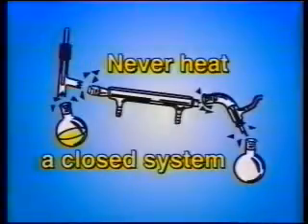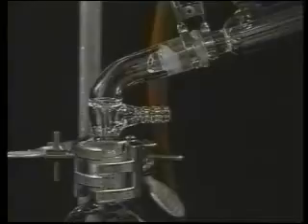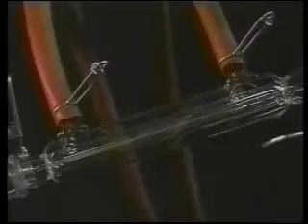Never heat a closed system. It may explode or fly apart. Have a look at the vacuum adapter sidearm. If it has an opening to allow pressure to equalize, then the question has been answered. This is not a sealed system and not a bomb.